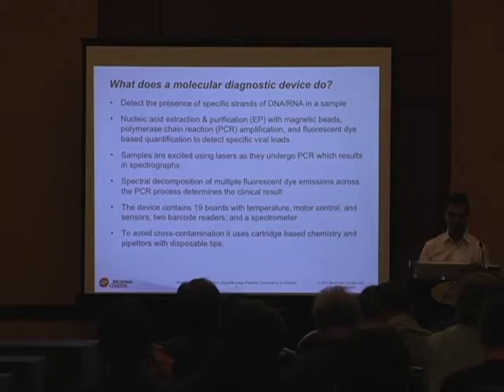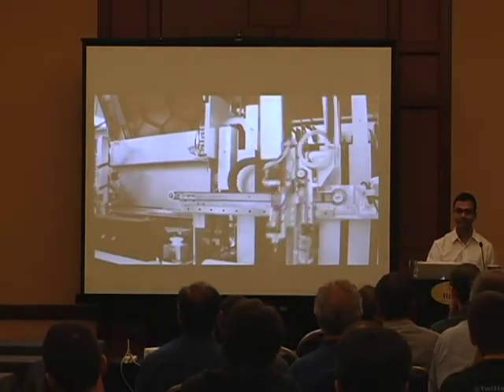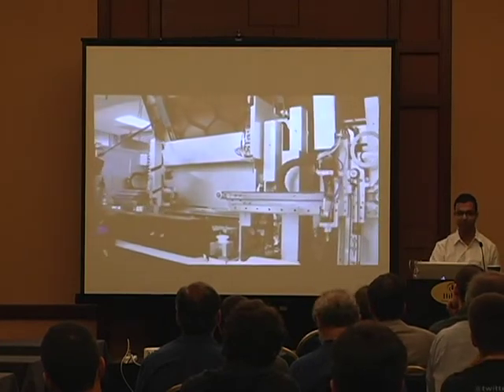As you can imagine, to process a bunch of samples, you need a lot of hardware. So we talk to 19 individual firmware boards. Each has multiple motors and sensors on it. And to give you a scale of how complicated it is, you can see everything's moving at the same time. I don't know if you can hear the volume.